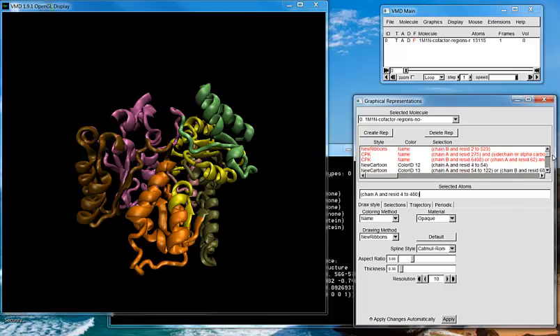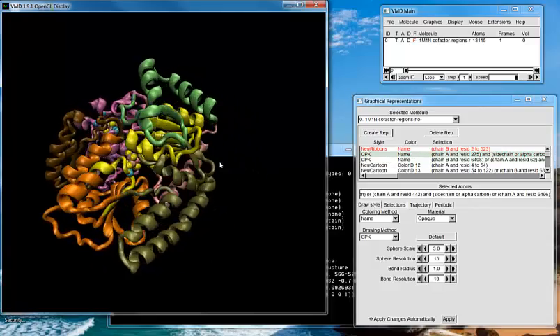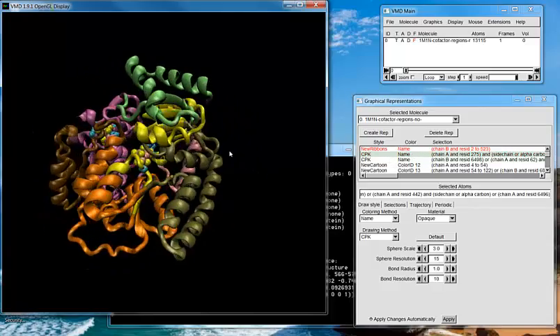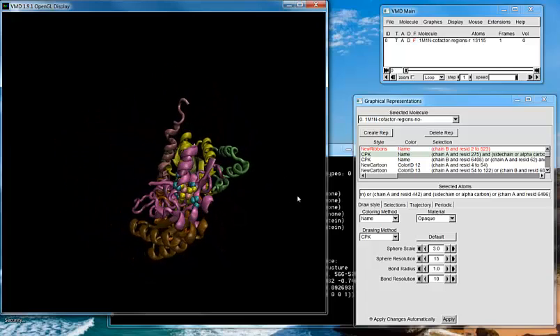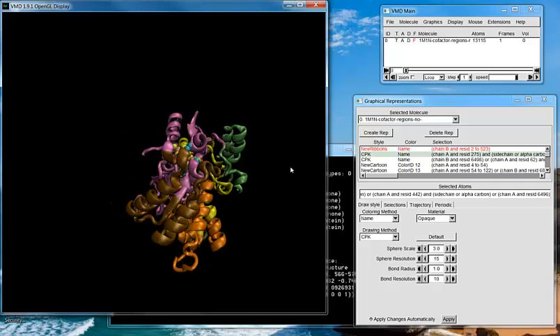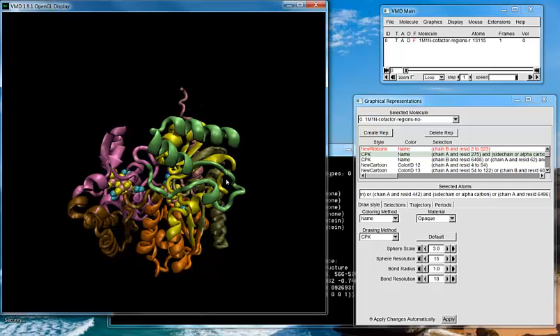Another thing I want to do is show a few of the pieces of this protein focusing more on the heteroatoms that are in here. And so I've drawn those in, as well as how they're linked up to some of the various components. For some understanding of that, you'd have to know a little bit more about nitrogenase. I'll go through that a little bit as I do the descriptions here. But these are the various pieces I've broken this into.